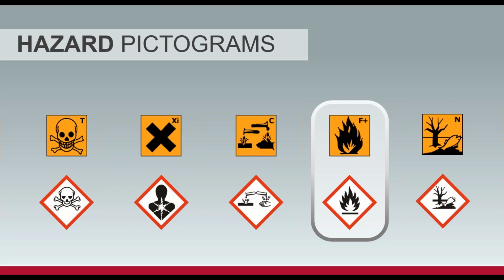If we look at 4 out of the 5 of those, it's very clear that we're all talking about the same thing, right? You've got poisonous, you've got caustic, or it'll burn you, acidic type stuff, flammable, and then the last one there, hurtful to the environment. But the inhalation one is quite different, as we all had our own pictograms and our own way of doing things. The problem with that is our clients are multinational, manufacturers are multinational, so we need to create one system. Well, that was created. It really talks about the pictograms.